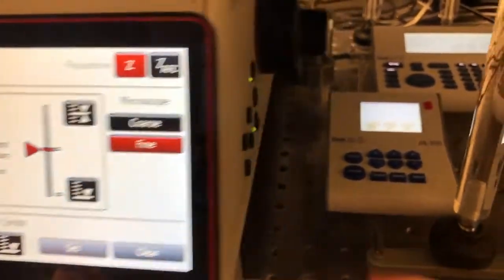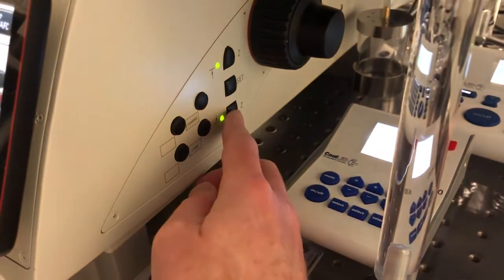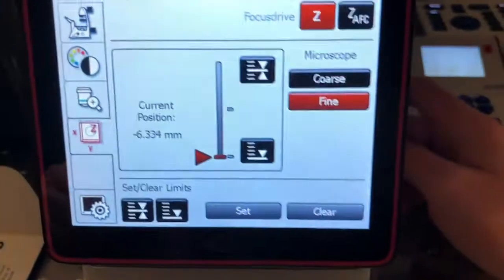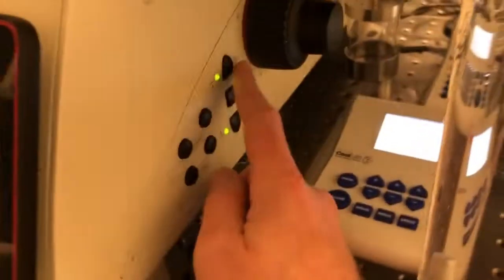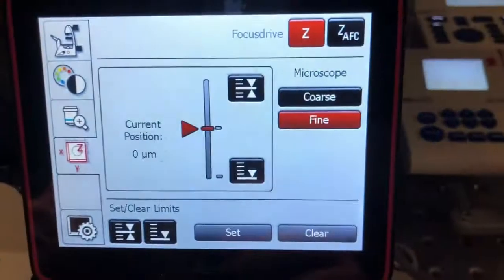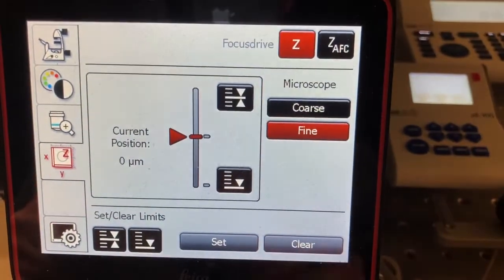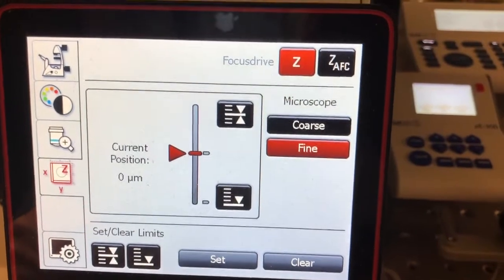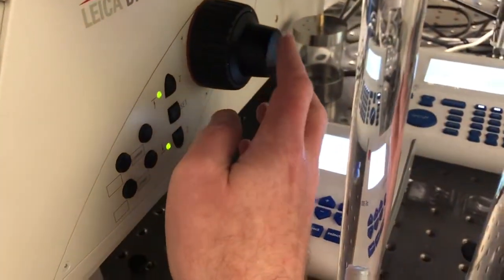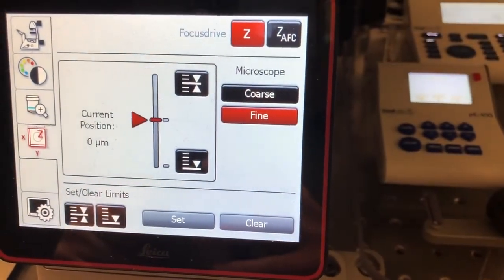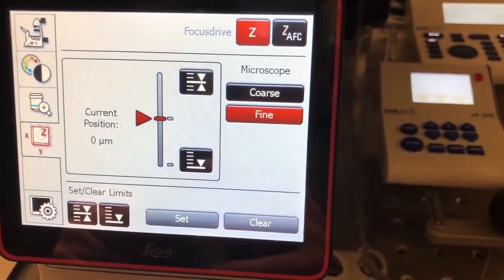Now when we use these buttons, if we use the down button it will go all the way to the bottom of the travel range, but if we press the up button and keep holding it, the microscope will go back to the position we had set as our working position. We can go beyond that by moving the focus knobs, but this allows a quick lowering and returning the objective to the working position.